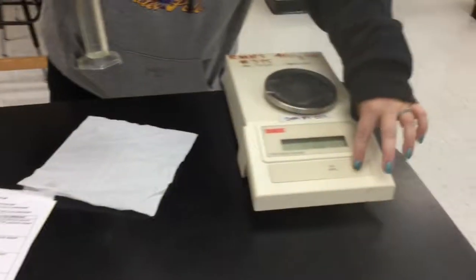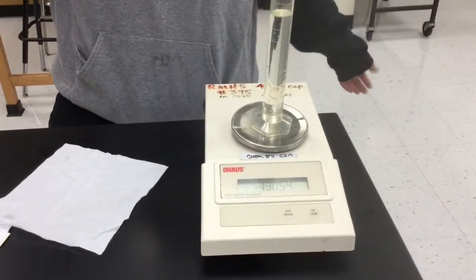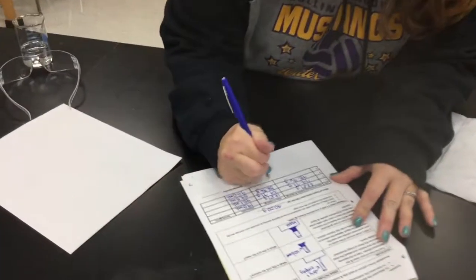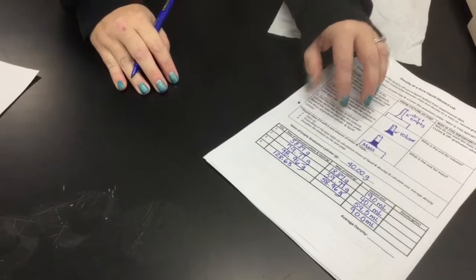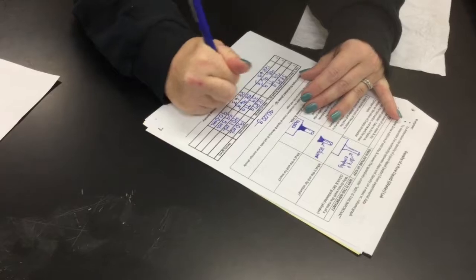Here it is. Oh, gotta tear that 0.00 off. All right. And it is... 128.63. 128.63. Okay, which is here. Minus 40, 88.63. I love that mental math.